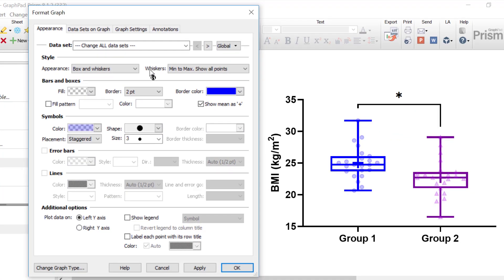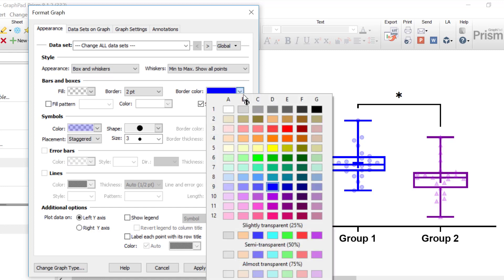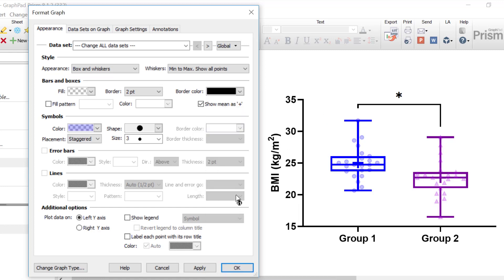For example, if I wanted to change the border color of all my data sets to black, I can change the border color to black, click apply, and now because the global settings are active, all of the data sets on my graph will have a black border color.